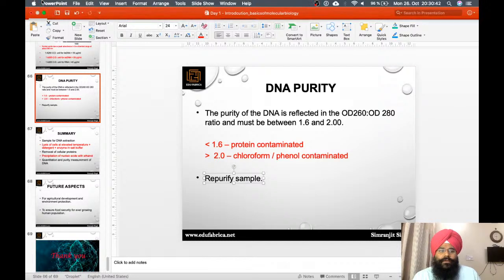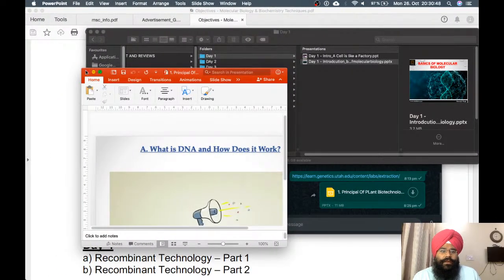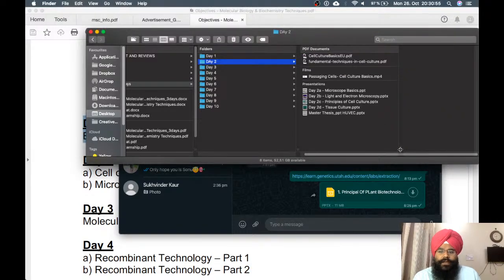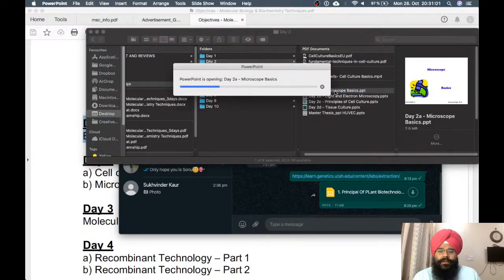Okay, so this is how we do it. Students, we already spent a lot of time on it, so I want to get on with today's lecture. I haven't started yet with you. So basically I will start first with the microscope basics.